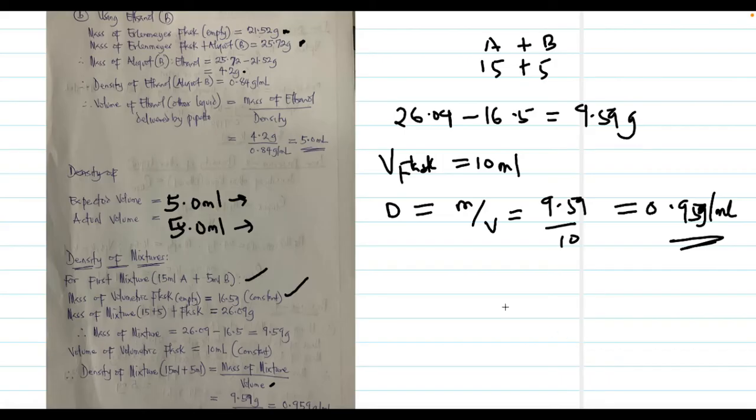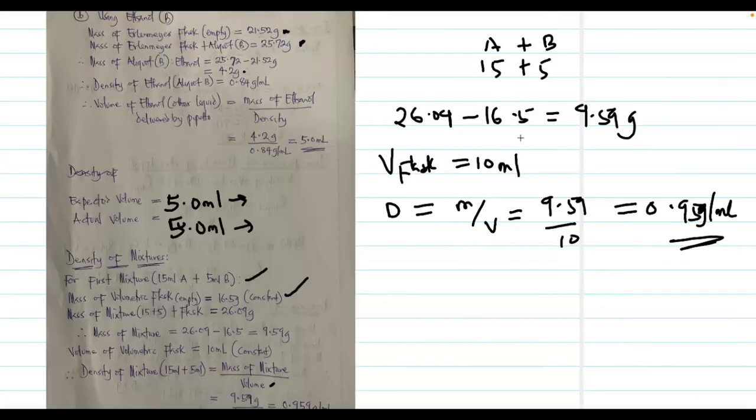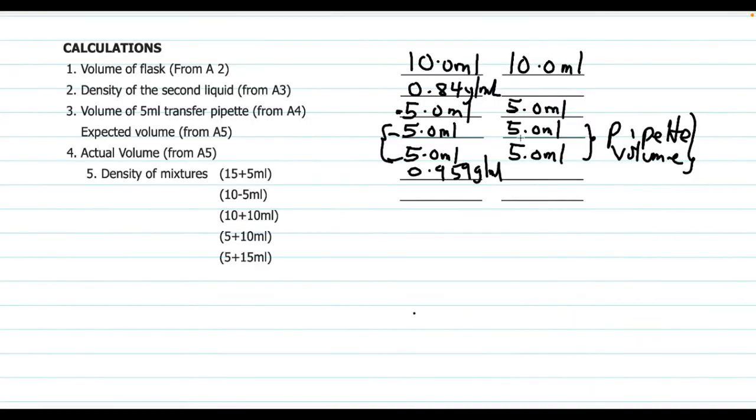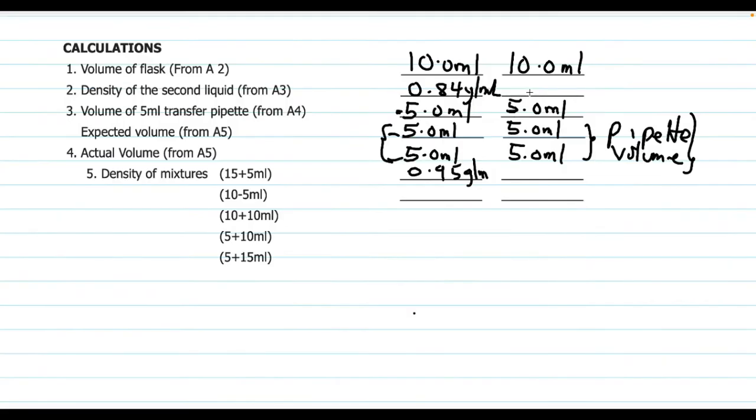We're going to record that here for the first one, 0.959 gram per mil. Sorry about that, I didn't see the first one.